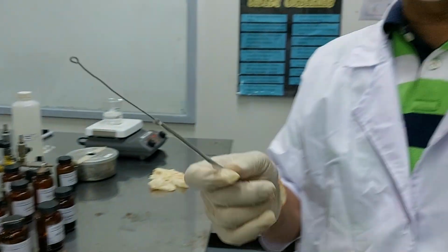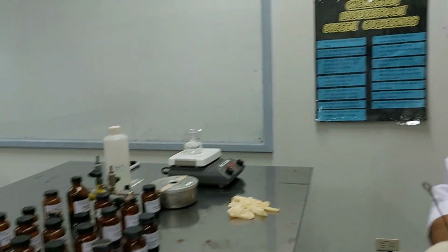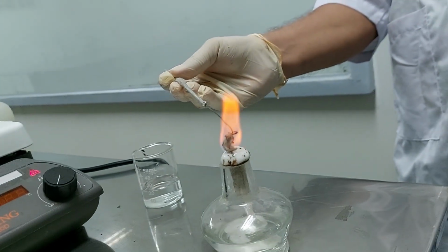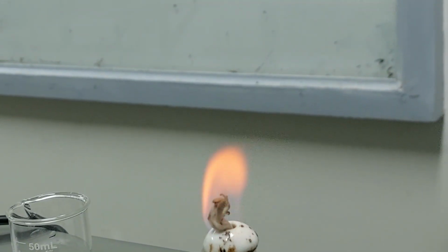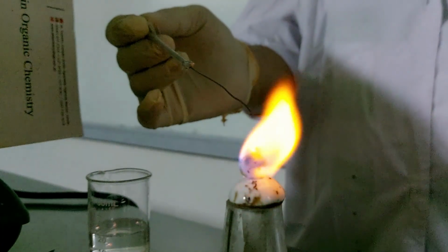Okay, so this is our inoculating loop. So we just get a small amount as a film here. And then we're going to heat this one using alcohol lamp. Okay, so this is our ethyl bromide. So let's watch carefully if there is a change in the color of the flame. Okay, observe the first color. Okay, see? Do you see that, class? Again.